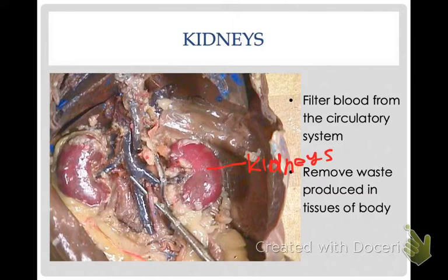They are on the lateral dorsal surface of the abdominal cavity, and usually when kids are dissecting in the abdominal cavity and looking at the digestive organs, they are also finding the kidneys as well. They're very hard bean-shaped organs. They do look very red like that, and they're on the dorsal surface, so they're towards the back underneath all of the digestive organs. And the kidneys are what filter the blood.